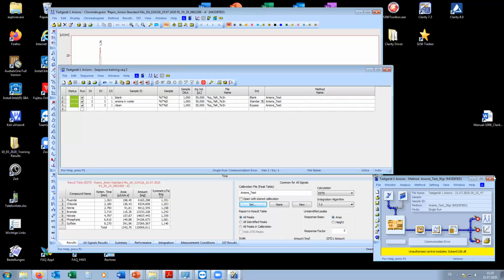I have a question. You showed me a lot of COM ports, like COM1, COM2, COM3, COM4 up to 8 or 9. So there is an extension COM channel, because the PC backside has only 1 or 2 maximum. Exactly, very good question. The computer is connected to the instrument through only one connector. All the serial connectors are connected to this UPAD, which comes with Clarity.